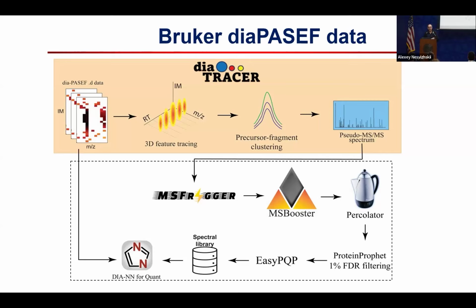For PTMs, it can be searched in a regular way with PTMs and tryptic or semi-tryptic search, something that's hard to do with other tools. And then once you build the library, you can pass it to DIA-NN, or the library is compatible with Spectronaut, or again Skyline or AlphaDIA. So you build a library, and then any tool can extract quantification from the original single-shot DIA files using that library. And you can build a hybrid library as well. If you have DDA data or GPF DIA data, you can build a hybrid library.